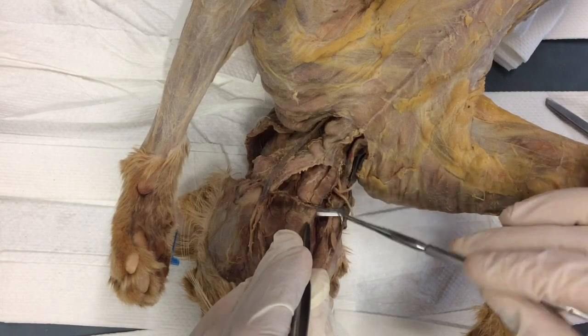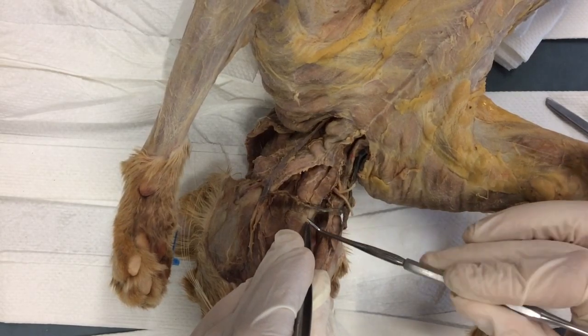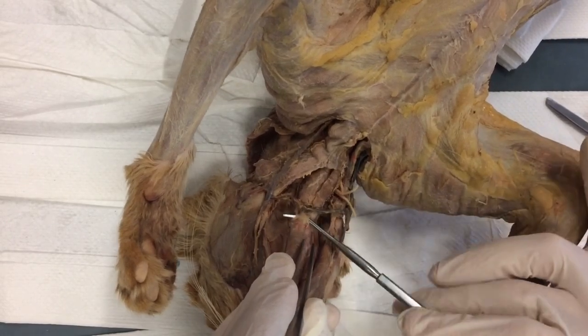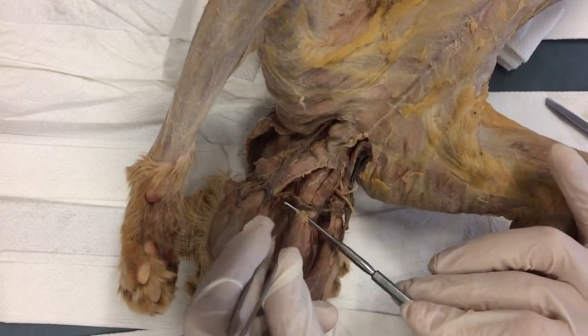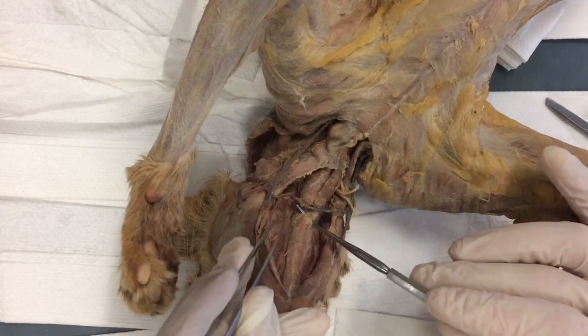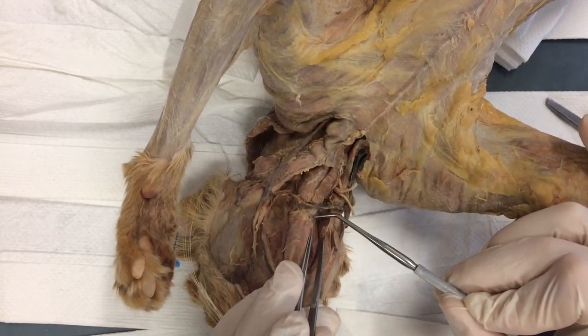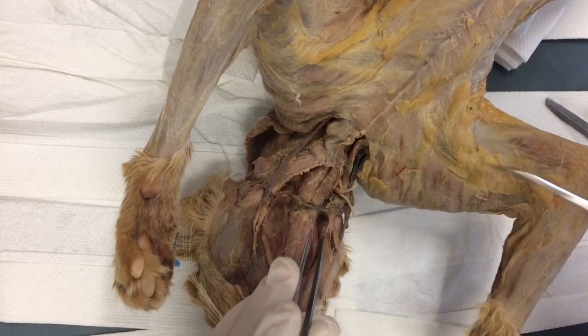Now watch, I'm going to take the round side of my probe into that hole. Check it out. And then I can just wiggle. See how I just wiggle that across and it came out on the other side. So even if there wasn't a tear there, I could make one. Now the goal here is to just completely disconnect the tendon all the way around.